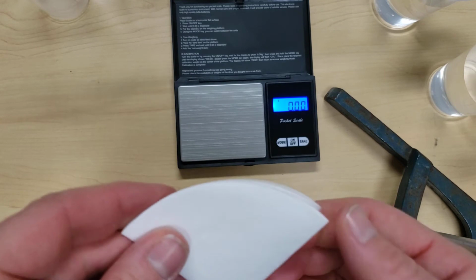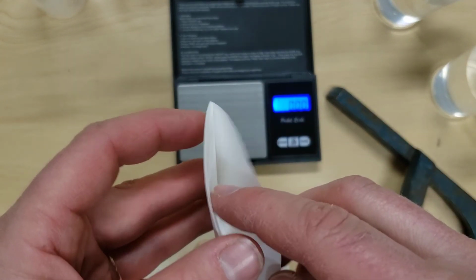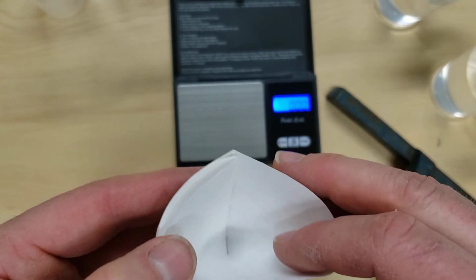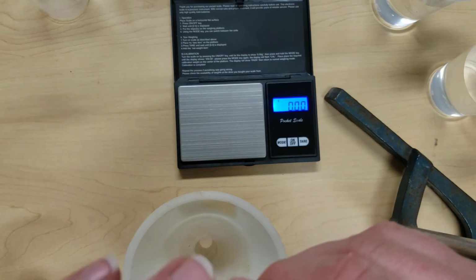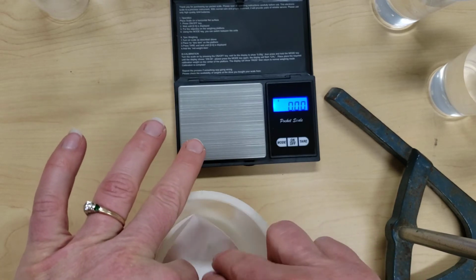And by doing that, you want to open it so that there's 3 sides, 3 sections of the filter paper on one side and 1 section on the other. So what that does is it doesn't allow any of the extra sand to sneak through into our container.